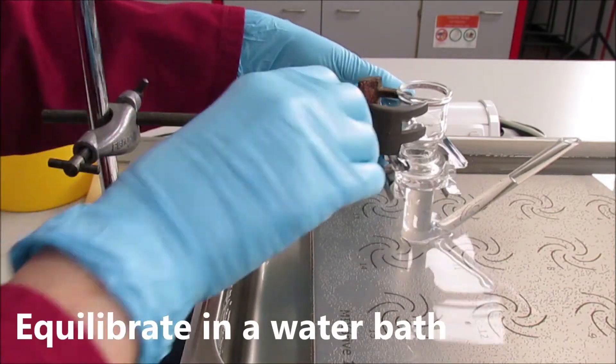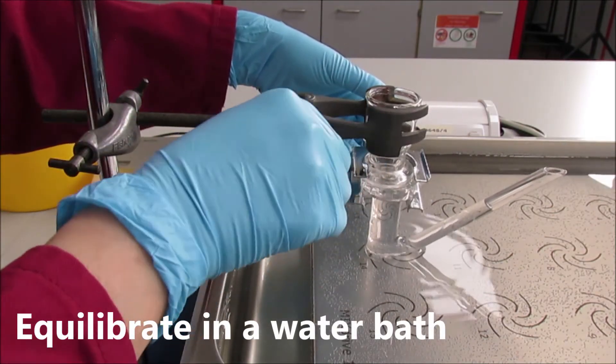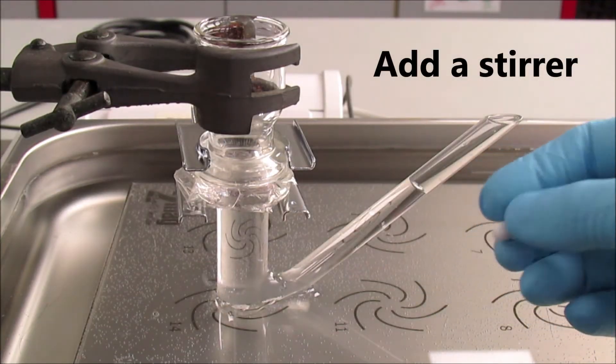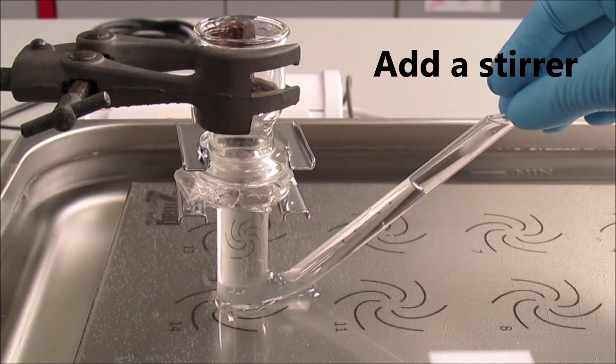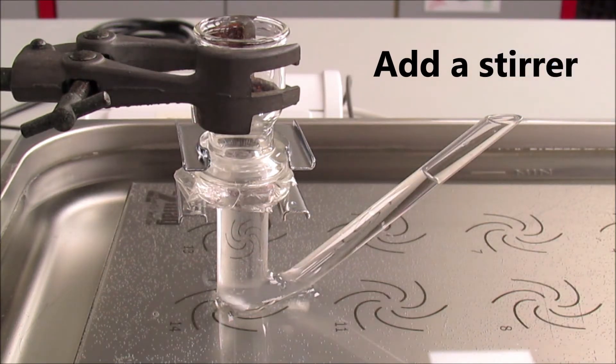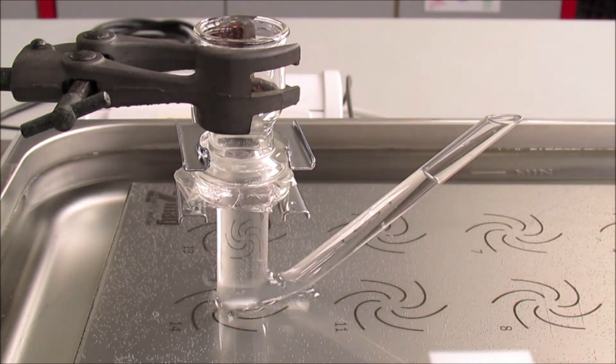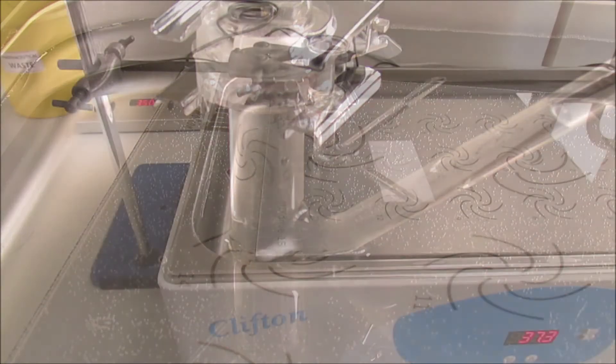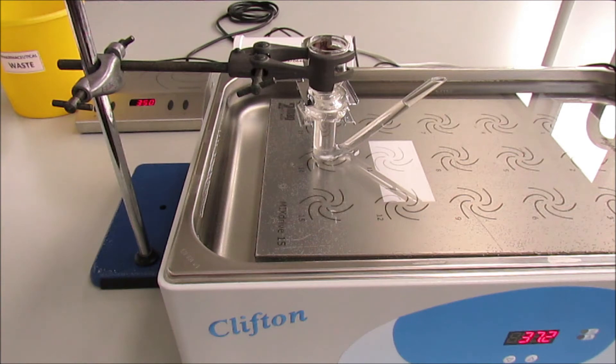That's how the FRANS cell is secured using a lab stand. That's how the magnetic bar is inserted into the receptor compartment. It should be stirring inside to ensure the perfect diffusivity of drug molecules.